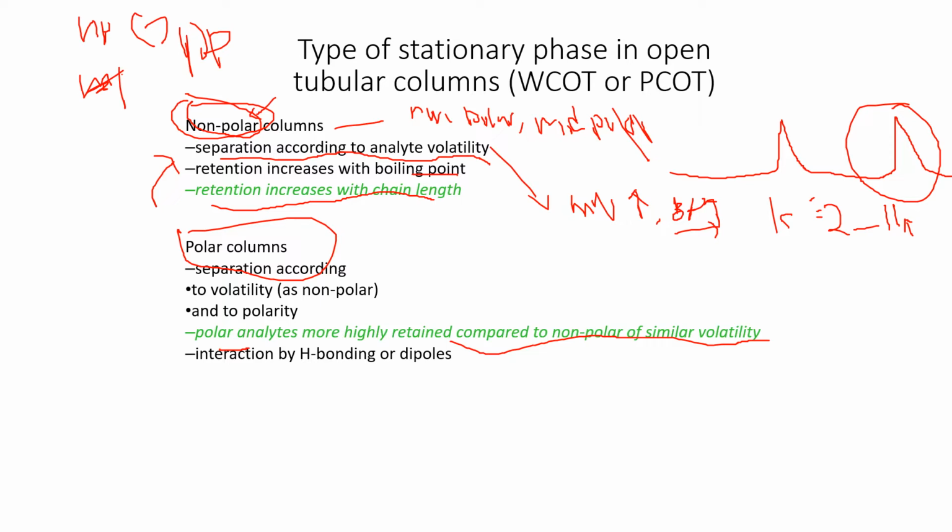It just bypasses the stationary phase, or maybe is absorbed a bit only, so you won't see the peak that much. But with a polar column it is even better, because they have interaction. The interaction is by hydrogen bonding or dipole. In a non-polar column it is usually van der Waals. For the dipole force, you have to remember back when we learned about the interactions last time.